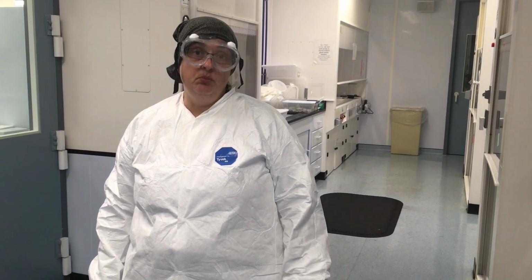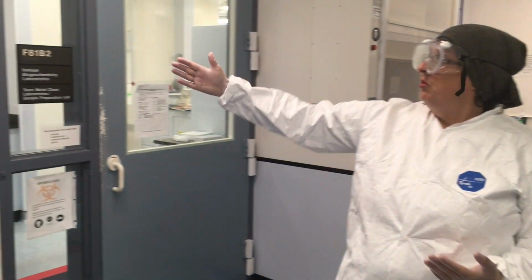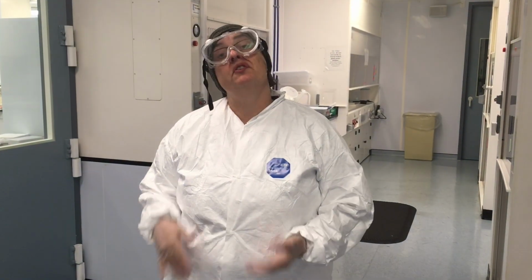So this is our trace metal clean lab. Since many of the samples we measure require some sample preparation, we have a lab that's optimized for measuring very low level blanks in samples. So you'll notice it's a little odd. For instance, the walls all look a funny color, and that's because they're all clad in plastic. We are horrible for organic blanks, but we're terrific for trace metal blanks.